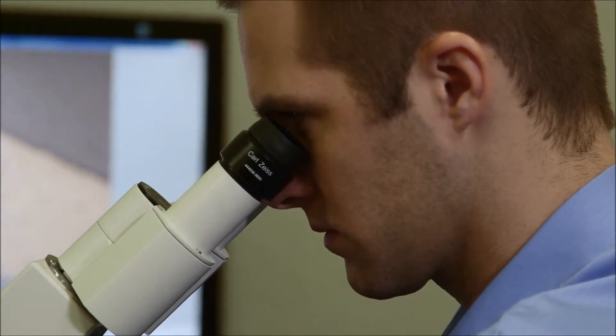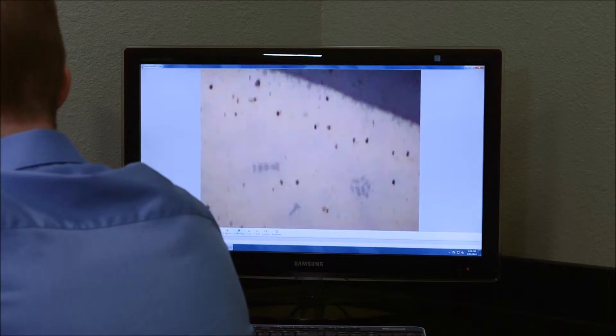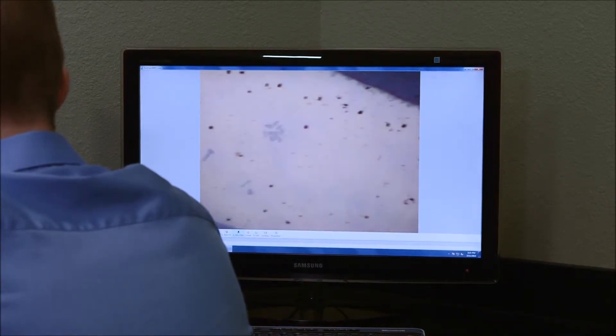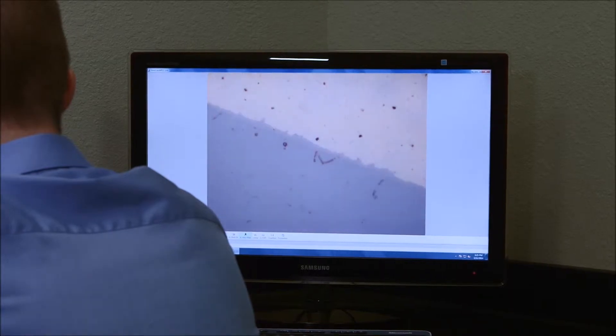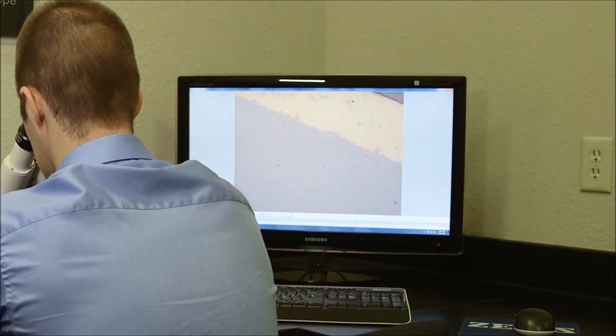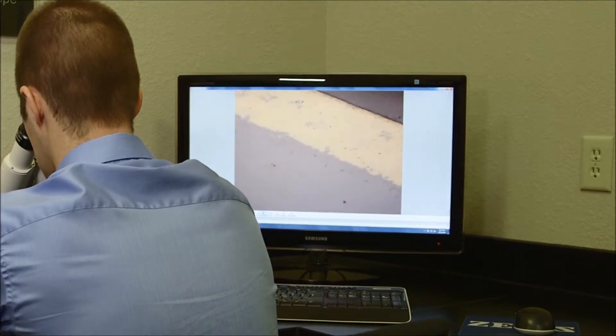And once we are analyzing this microstructure under the scope, we can also identify what is the thickness of the coating, what is the average carbide percentage or porosity percentage that might be within our coating, and we can also identify if there's any unusual phases that might be existing in the microstructure.